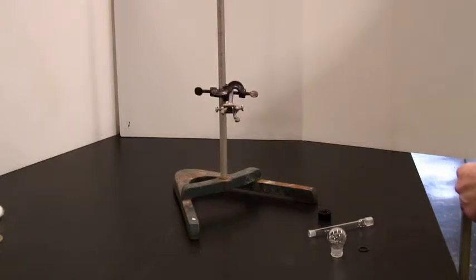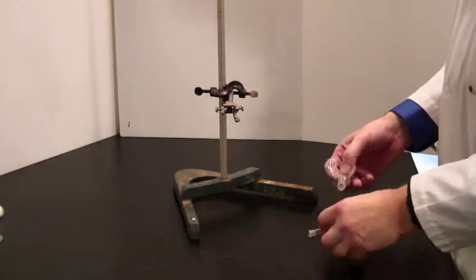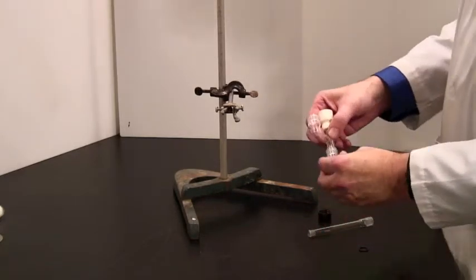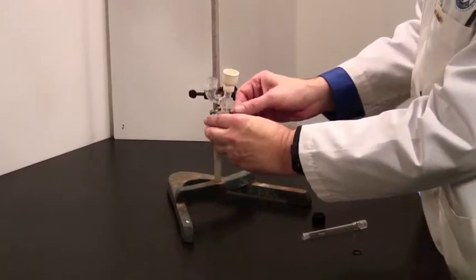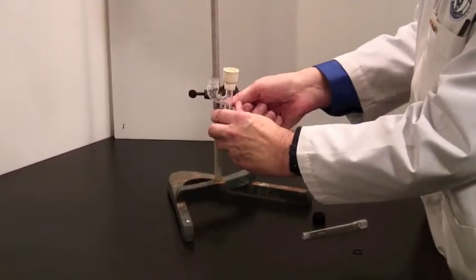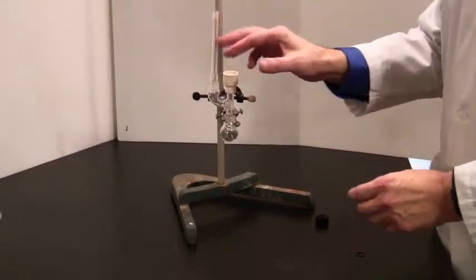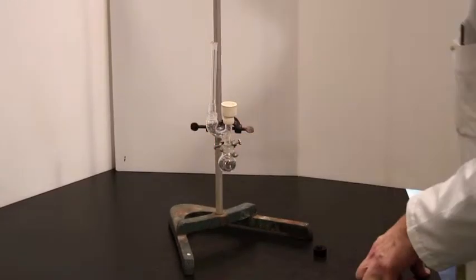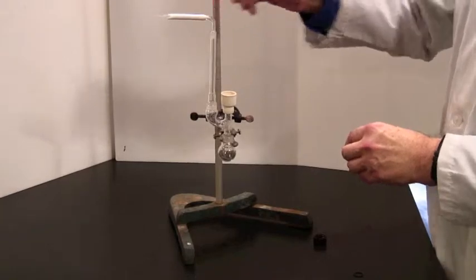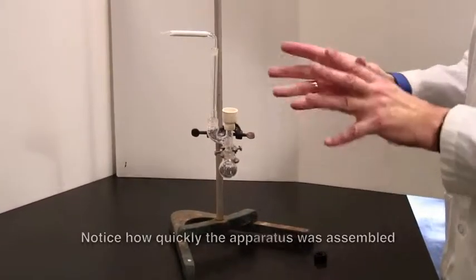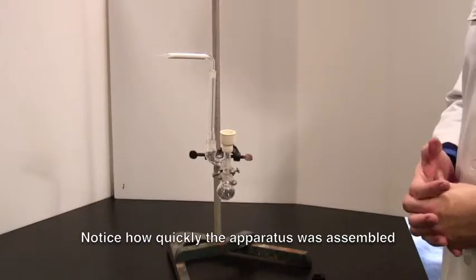You will need to take the Claisen head that you've attached something to, and it will go in here, like so, and then be clamped in a three-finger clamp like that. You will then put your air condenser in here and stop the top end of the air condenser with the drying tube. If you can do that kind of setup while the glassware is still warm, that's a good idea.